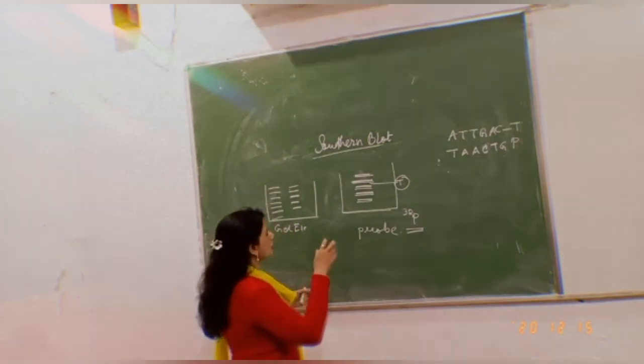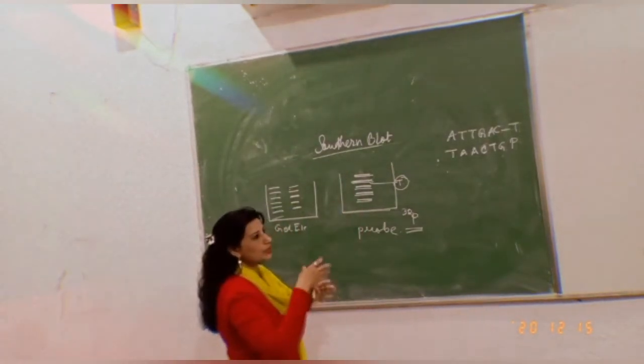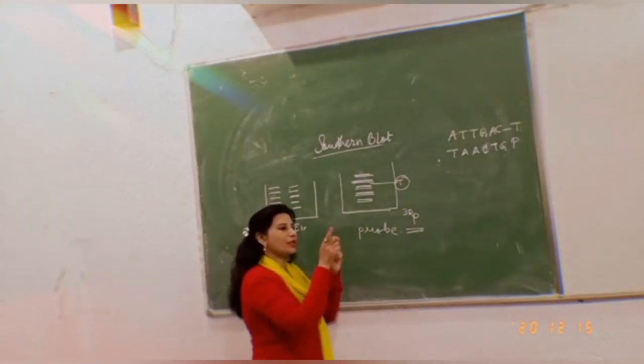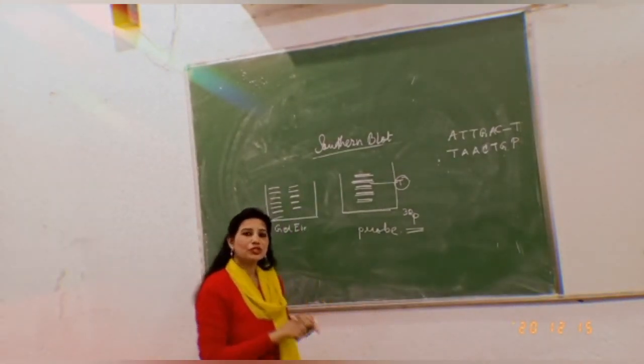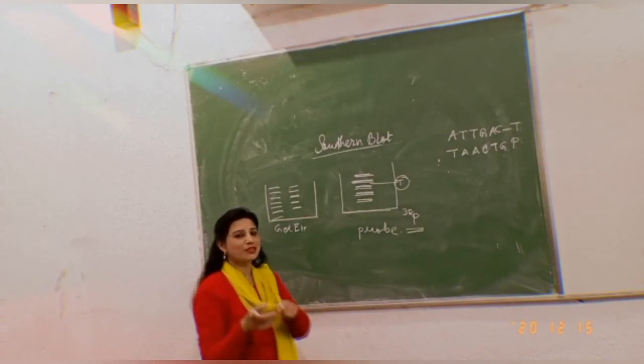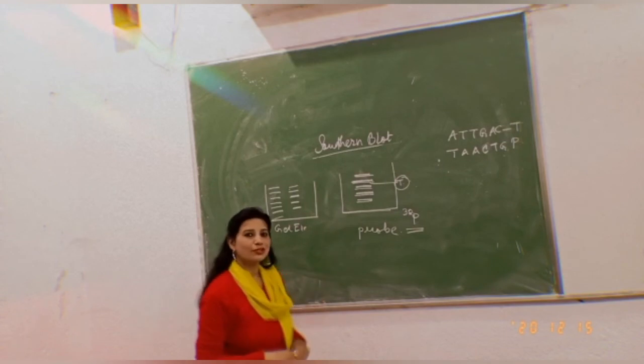So with all helical structures, when I will be doing this, the probe will be used, and the probe will attach to a particular DNA molecule, which is my target. Because it will match with that one only, it will not match with everyone. Every strand it will not match.